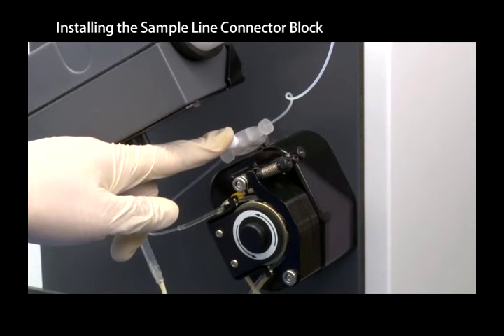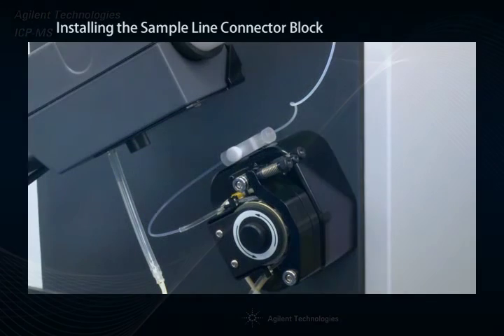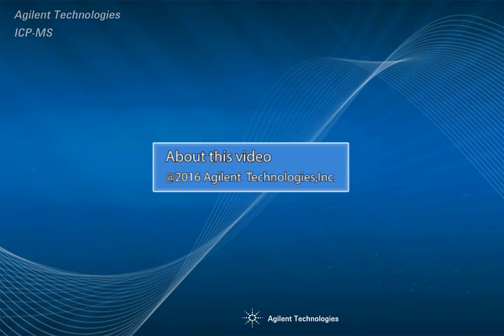If the leak persists, check the ends of the tubing and re-trim any rough ends before refitting.